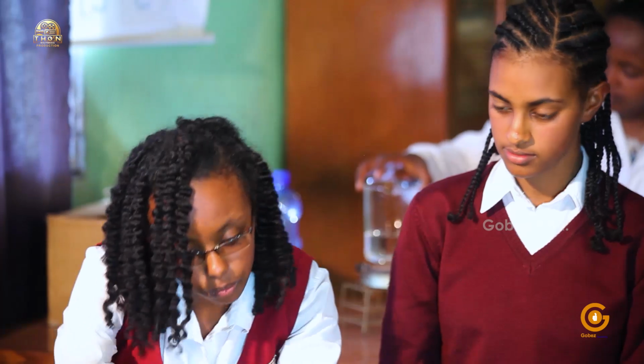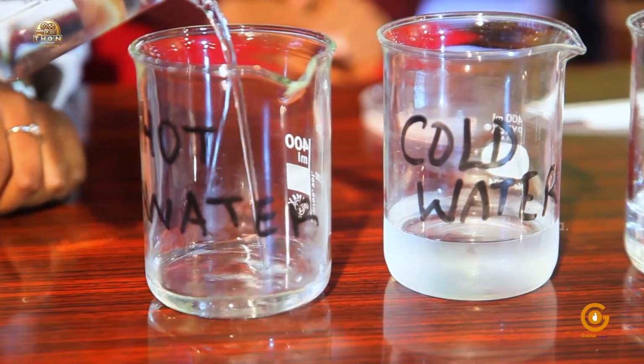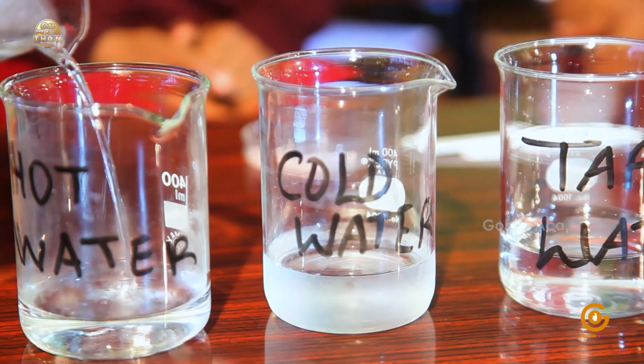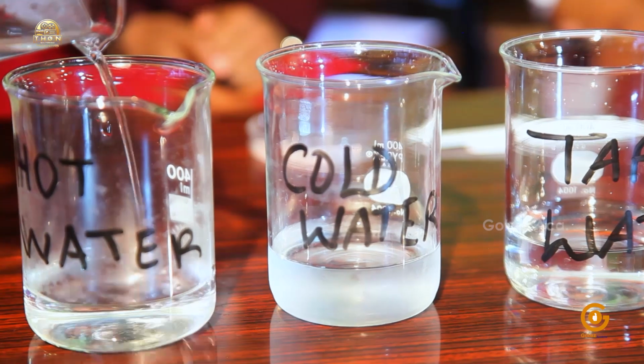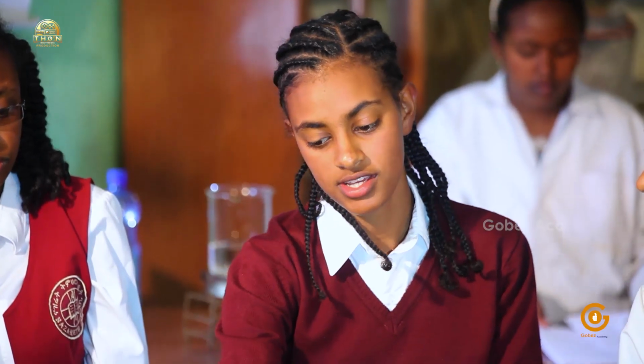And carefully pour into it boiling water. We will now put equal amounts of powdered drink into the prepared beakers and observe the diffusion in 30 seconds.